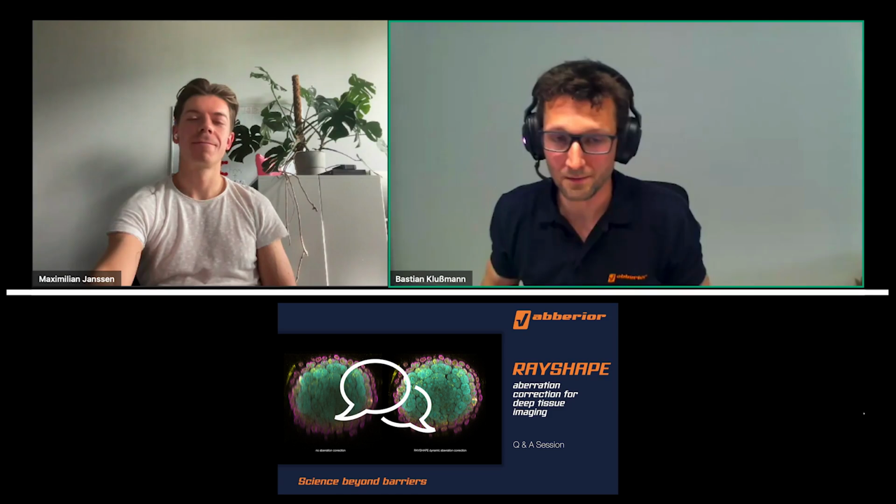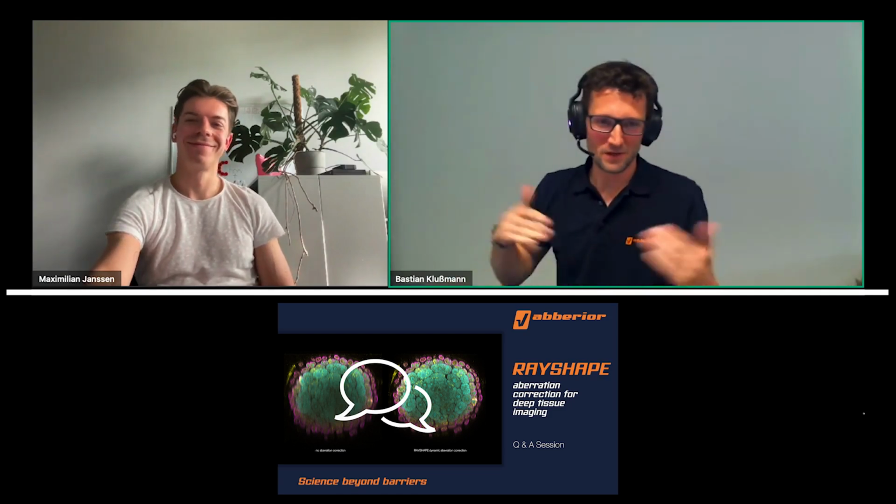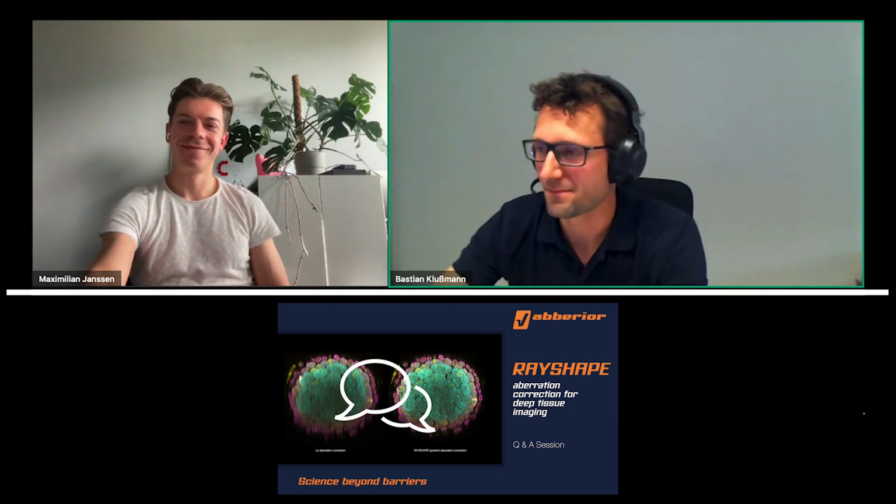Yeah, as I said before, you basically define the top and the bottom in the beginning, and then it will automatically adapt. This is also why it's called adaptive, right? It adapts to each sample position and each sample depth.